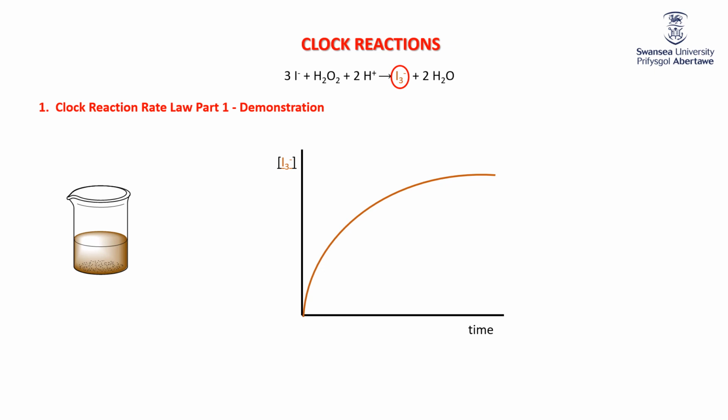And so what we are doing here is using color in order to determine the concentration against time, and so thereby we can start generating the rate of the reaction and so forth. More complicated calculations than you do at A-level, but a cute little demonstration for you.